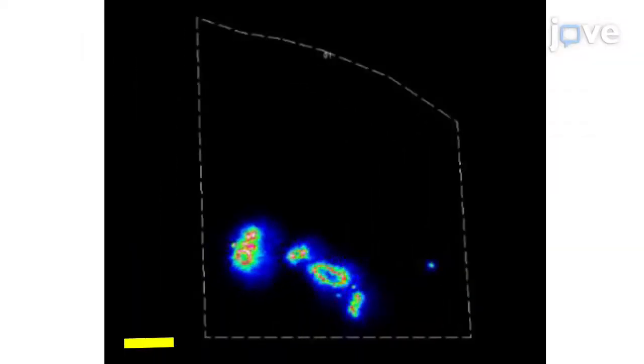This is verified by single-ion images of these individual amyloid beta peptides.